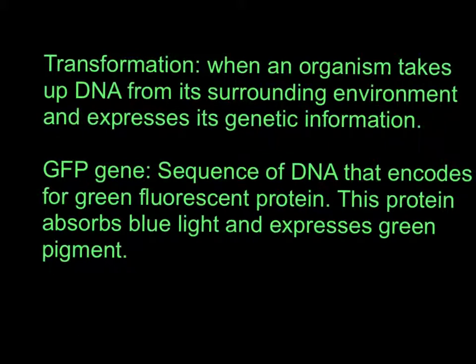GFP was the gene of interest for this experiment. It's a sequence of DNA that encodes for green fluorescent protein. This protein absorbs blue light and expresses green pigment. This served as a marker to identify which were the bacteria, or E. coli, that were successful in transforming.